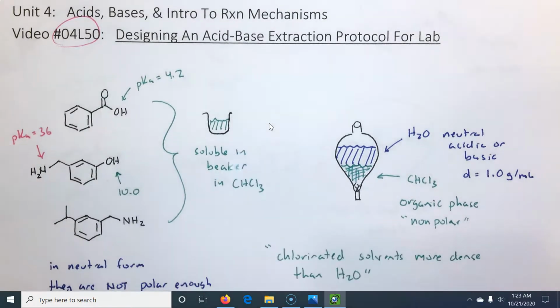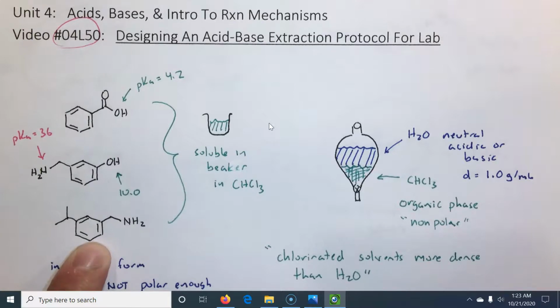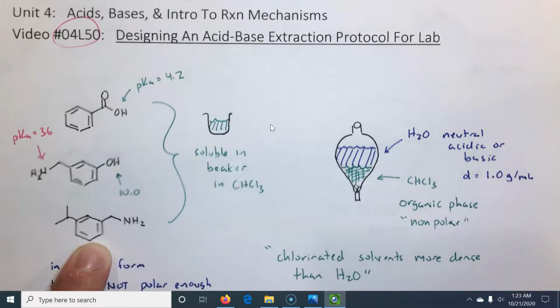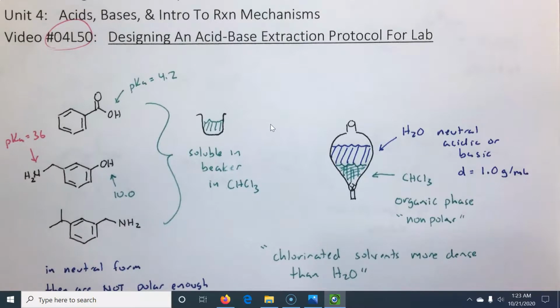The point is, this molecule will never go into the water layer when you use a basic aqueous solution, because this will never be deprotonated by any of those two bases. It can be protonated with HCl, and we could do it that way. So we have several options.